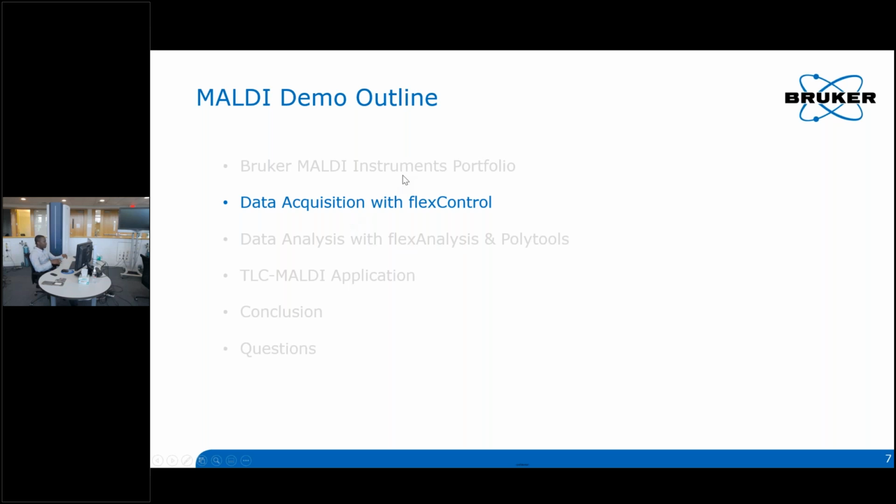So that was a short introduction on how polymer MS works. Next, we're going to go into data acquisition and analysis. Again, just a quick reminder, make sure you adjust the different windows that you have to make sure that you can see the software that I'll be sharing and also be able to follow along as I analyze some of these samples.